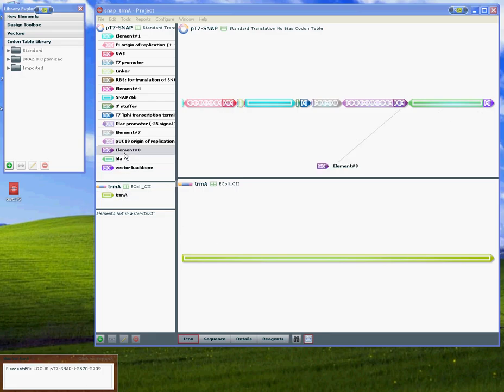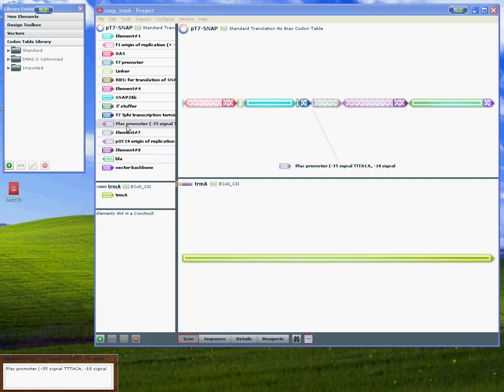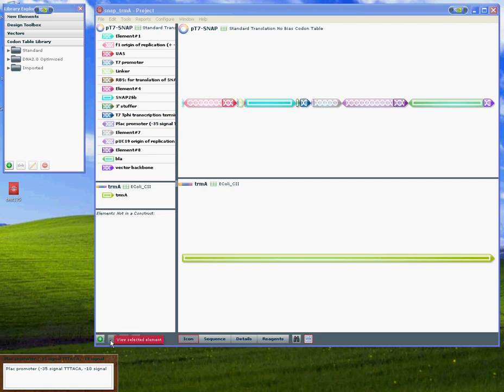As you can see, the annotation for each element is shown in the lower left corner. You can add your own elements, select elements, edit, and delete elements as you please.